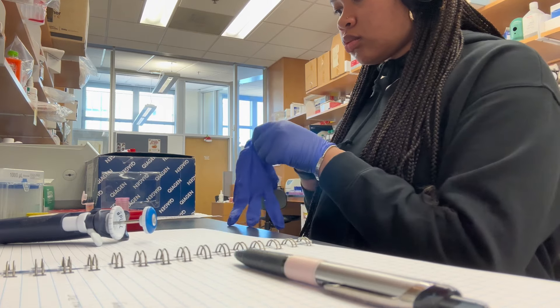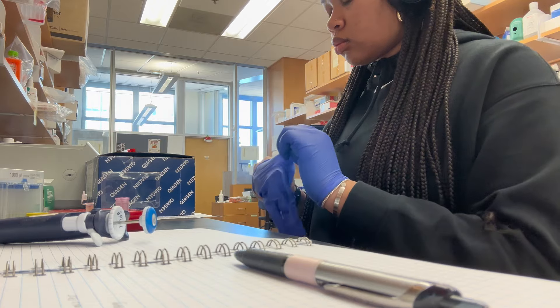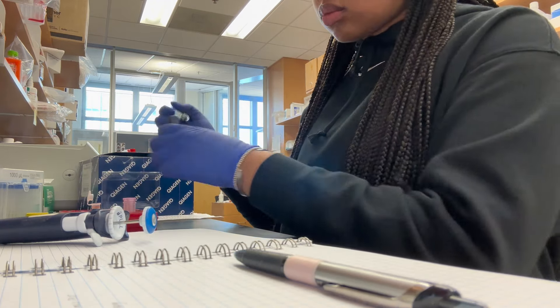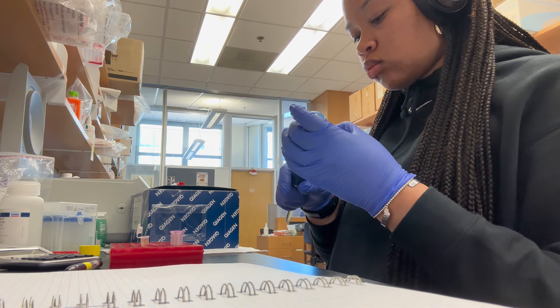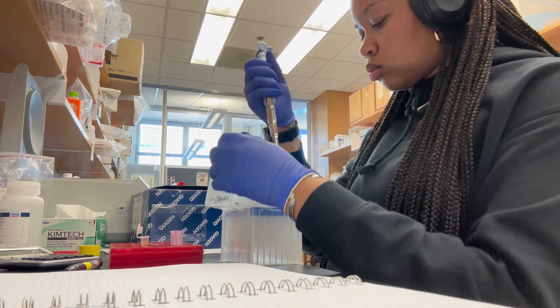And then I get to work. So the first thing that I do in the lab is put gloves on. And I struggle so much putting gloves on, I don't know why, but I just struggle. But I label my samples, and this is me about to extract DNA from a gel.